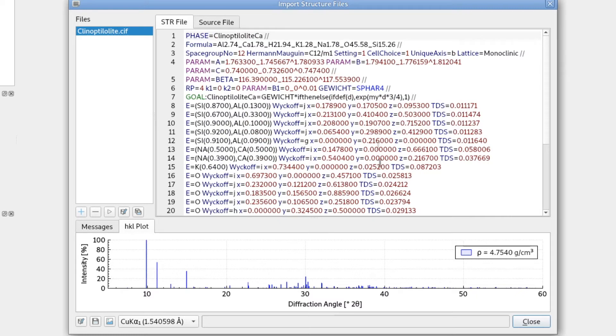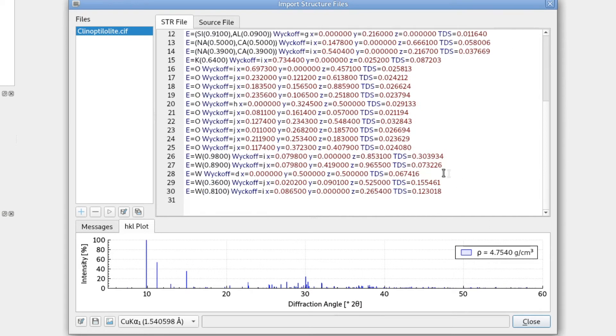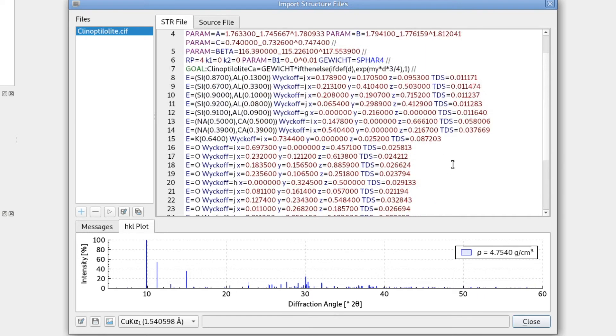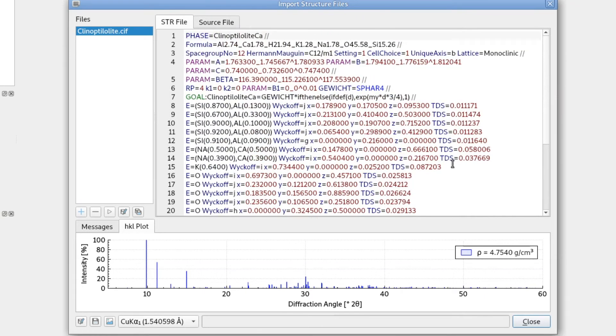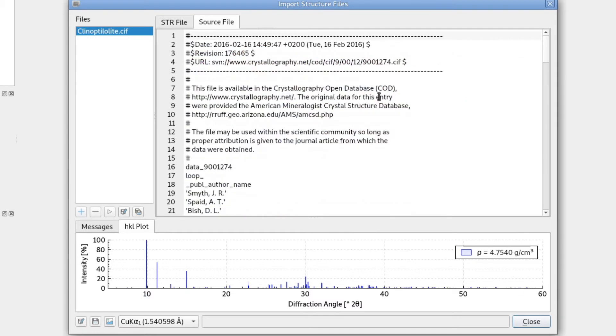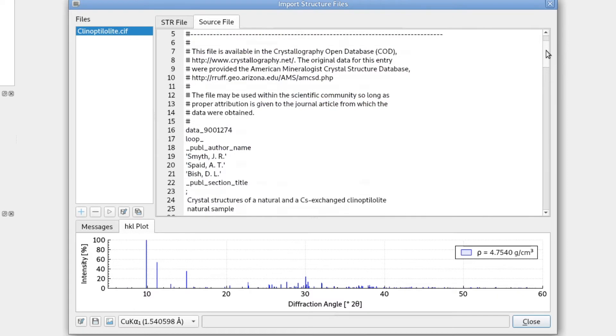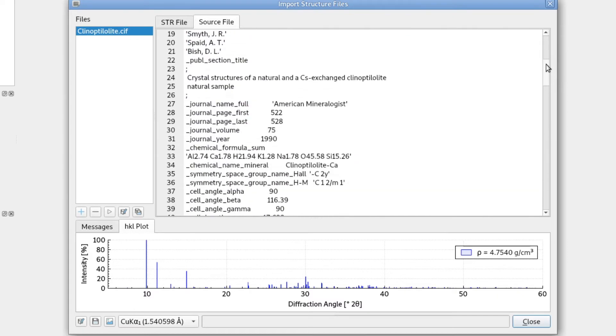However, if we look at the calculated density, it is very high. It is more than four grams per centimeter cubed. So for a zeolite, this is way too high. So there is still a problem with this file. And if we go to the source file, that's the CIF file downloaded from the database. Again, we scroll down to the list of atoms.